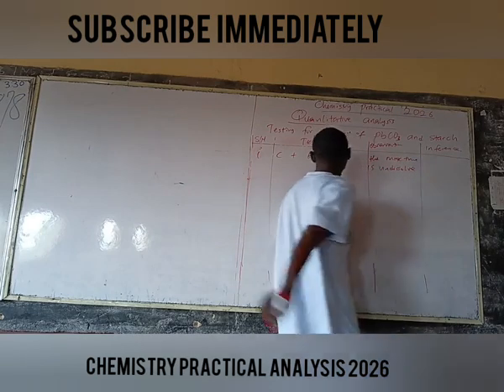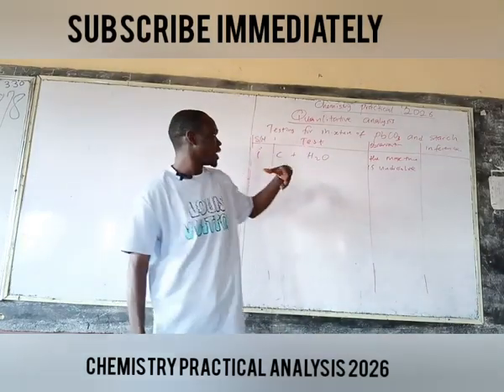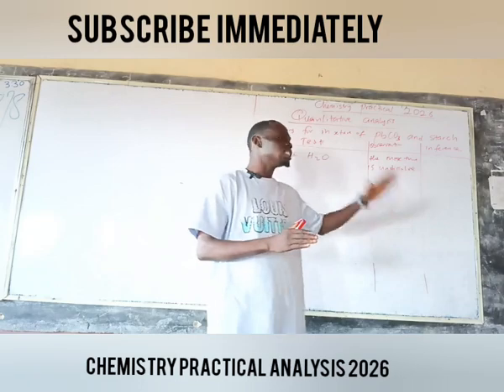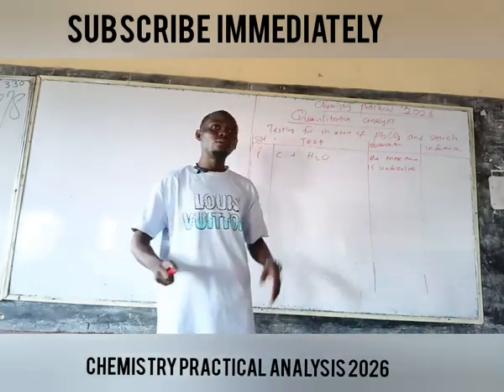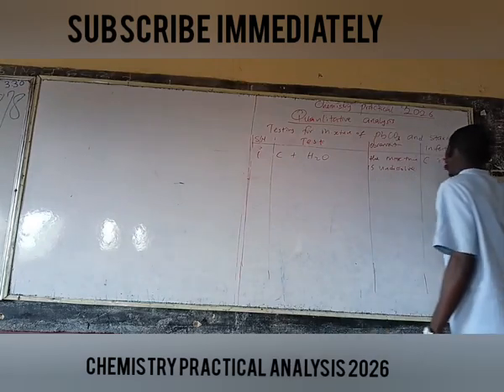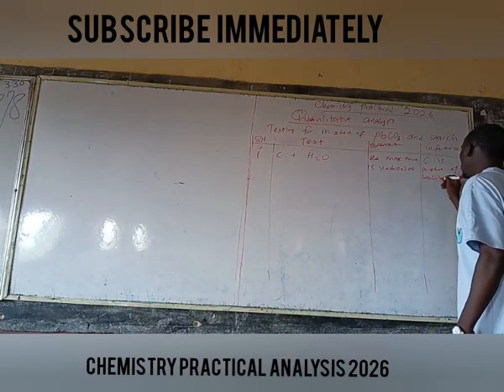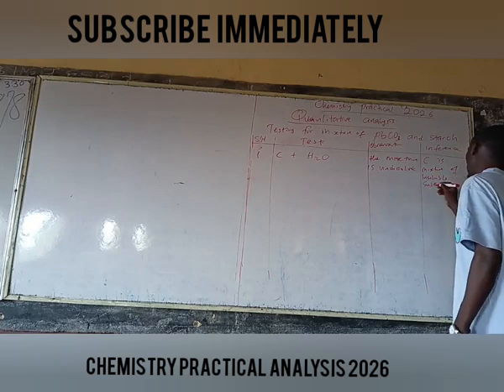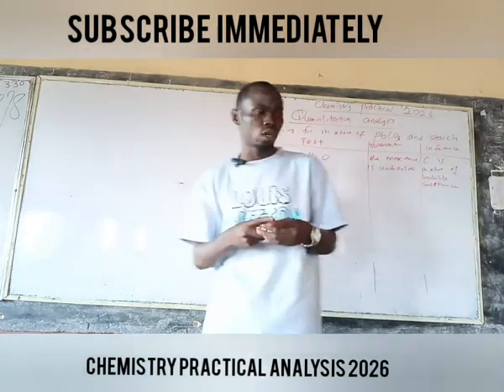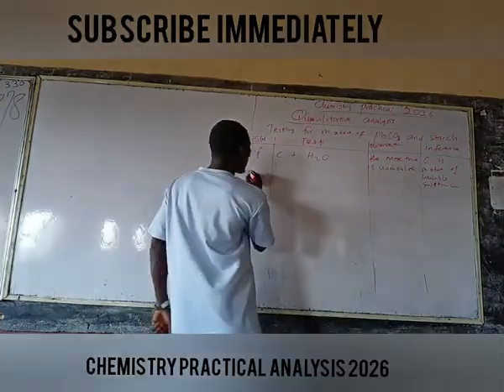So when the mixture is undissolved, what is the inference? If it is not stated as a mixture, just say that C is an insoluble salt. Or if it is already given that it's a mixture, then you say C is a mixture of insoluble substances, as defined in the question. If they already tell you that C is a mixture of salts, then you say insoluble substances. Now, what's the next thing?